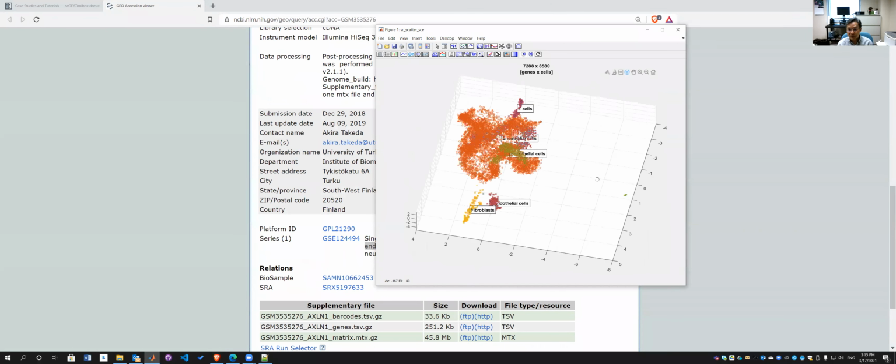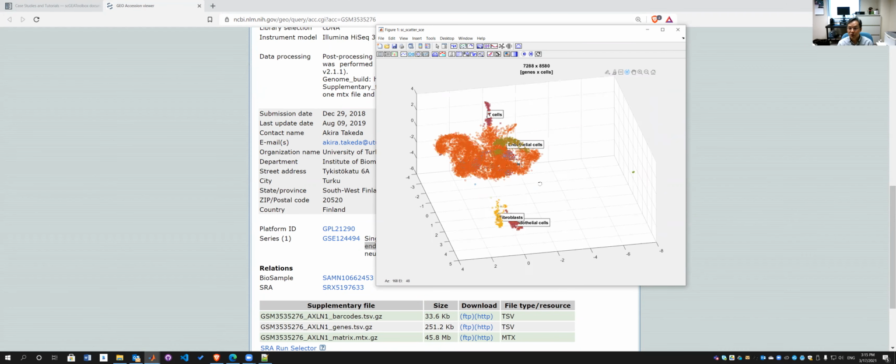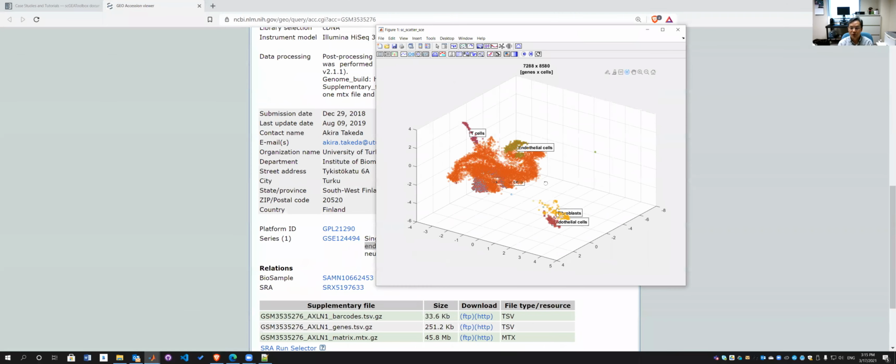And so far, I think we did a very good job to clean the data, download, and then visualize the relationships and confirm the majority of them are endothelium cells. Okay, so for those special cells in this tail, we don't know, maybe some contamination from T cell related.